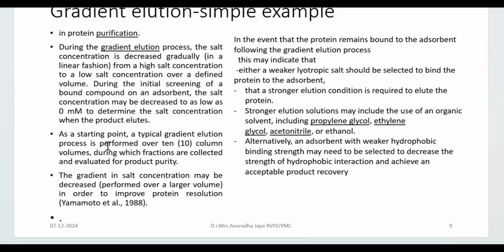So hydrophobic interactions are going to occur, and they can be very well overcome by using an appropriate mobile phase, which is going to be more interactive with the analyte rather than the adsorbent. At the same time, a second approach could be to reduce these hydrophobic interactions of the adsorbent, so it will not hold the analyte for a longer time.